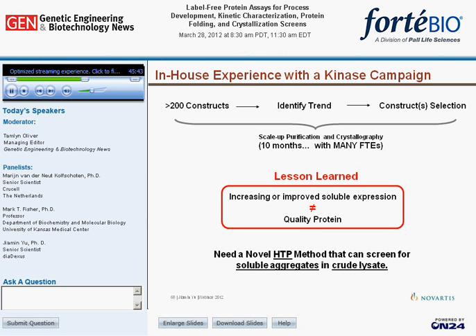To me, this was obviously not the way to go, and there was a need for a new assay to be established which can screen for soluble aggregates, ideally in crude lysate, to save time. And to be able to do this, you need a system that will meet 3 criteria: it needs to be able to tolerate crude lysate and needs to be able to specifically identify your target protein from many other proteins present in the crude lysate, which means the method needs to be antibody-based. And lastly, the measurements need to be done in a high-throughput fashion. To my knowledge, no method was able to do that at the time.